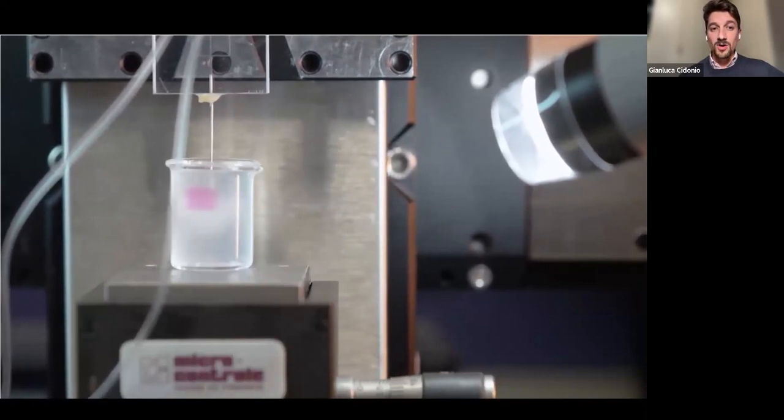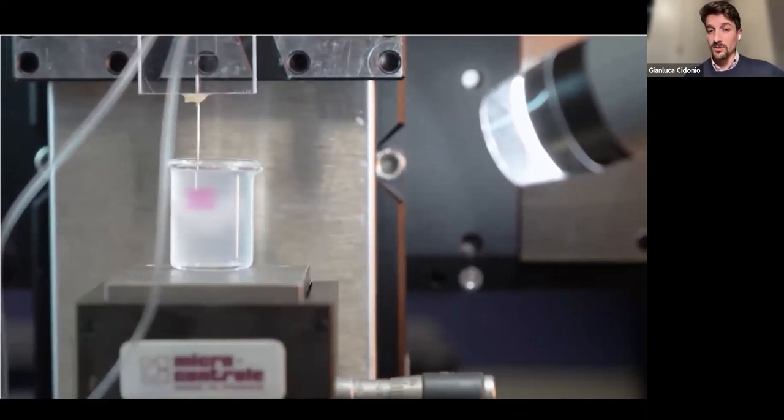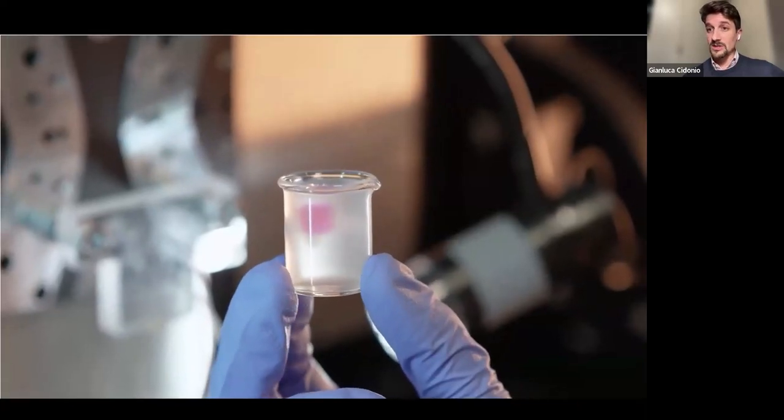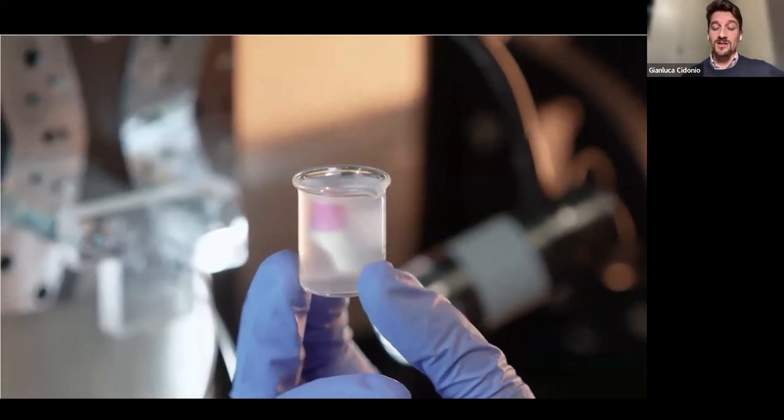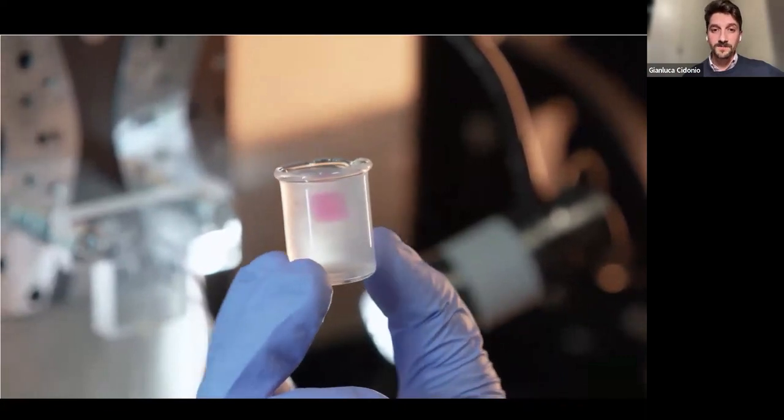So here we don't have to change print heads. We don't have multiple print heads. We just have multiple inputs, and we have the ability to pattern the final construct in a really stratified manner.